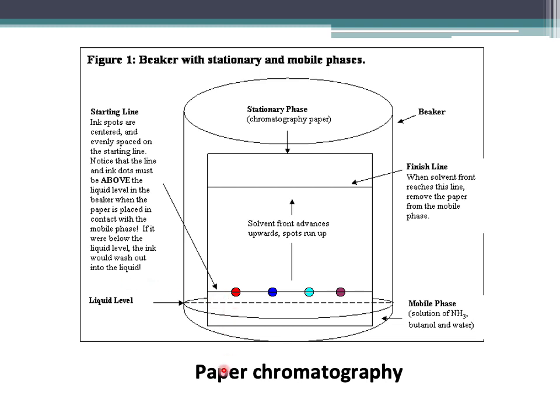Sebab apa? Ink tu dia dah cuci pula. Kalau kita letak liquid tu pada permukaan ink tu, pada spot tu, nanti dah wash out. So macam mana kita nak menengok separation kan? So kita kena letak spot tu, kena letak atas level air tu. Ni liquid level. Spot kena letak kat atas.